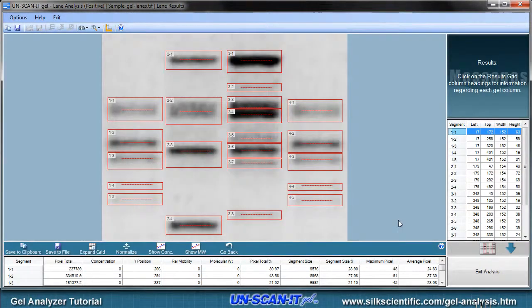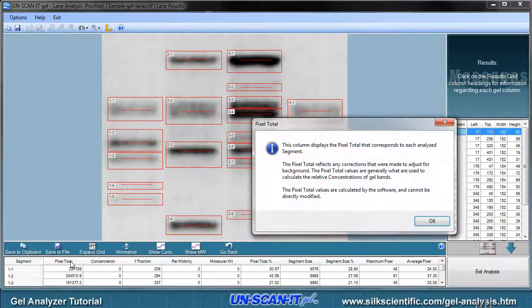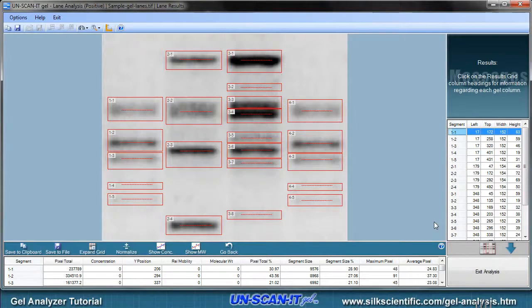After all the bands have been analyzed, the results screen will be displayed. Clicking the column headings will display a description of the data in that column. You can also use the results spreadsheet to create a concentration calibration curve or molecular weight calibration curve using values from a standard.